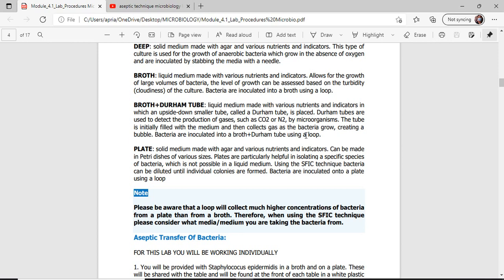Common sense na lang niya class, hindi ka pwede gamit sang needle kung magkuha ka sang mga liquid naturally. Okay nga amad, wala sa may matapik. Okay, may matapik but small quantity. Therefore, it will not be enough or tugay siya katama mag-grow kung liquid to liquid ka magpatubo sang imong nga microorganism. Okay? Then you have your plate.